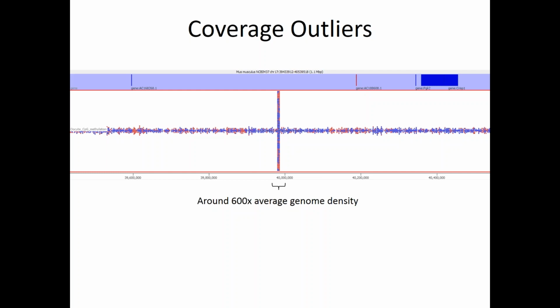So just looking at your data, understanding the structure of it, and if there are strange looking parts or parts with unusual coverage, identifying those and keeping a note of them, so that if the hits that we get later come out from those, we can choose to maybe ignore those or investigate them more closely.